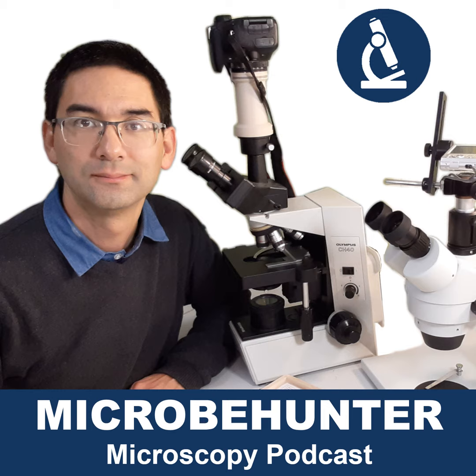Okay. Of course, if the specimens that you want to look at are large, then you are almost forced to use a stereo microscope, unless you want to cut apart the specimen. If you do not want to do a lot of specimen preparation in the first place, that could also be an advantage for stereo microscopes. And also, if you're interested in macro photography, then I would probably recommend that you buy yourself a stereo microscope first. Now, I'm not saying that all of these points are exhaustive. Maybe there are other good reasons as well, but these are the ones that I could come up with at least.